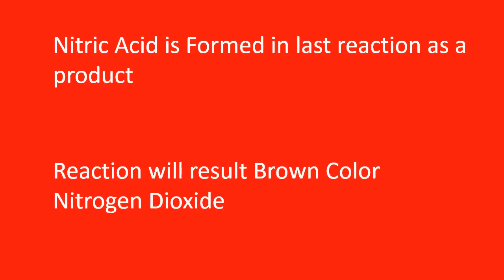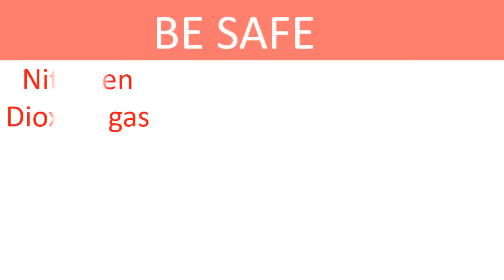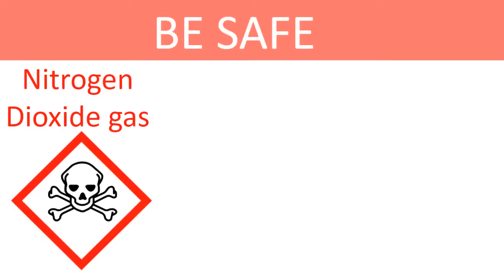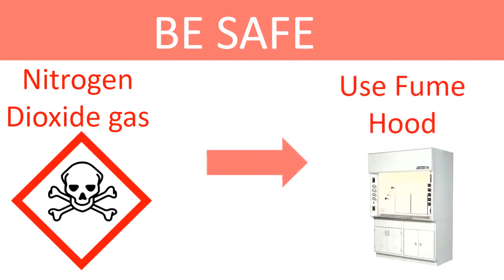Now, we are going to observe the reaction between nitric acid and pure copper. Due to toxicity of nitrogen dioxide gas, the practice is performed inside a fume hood.